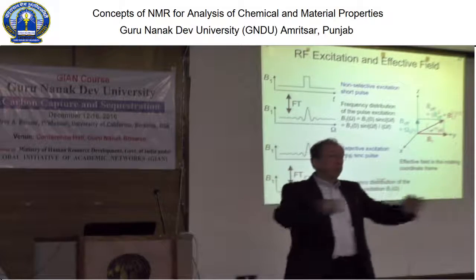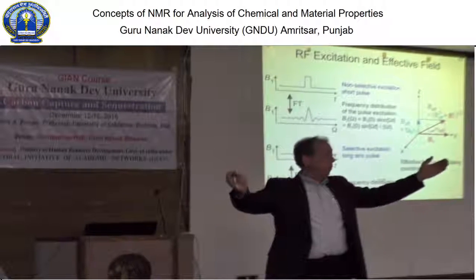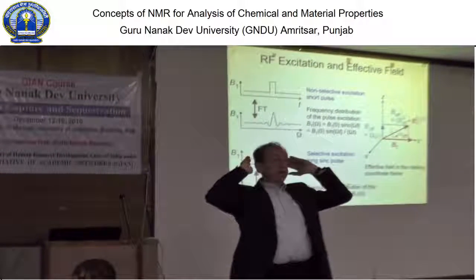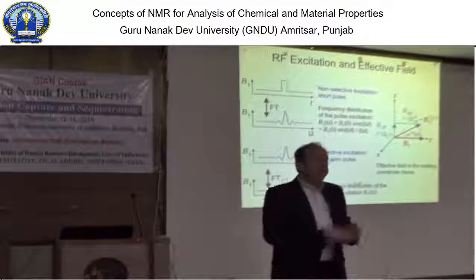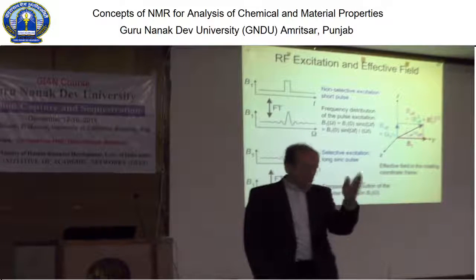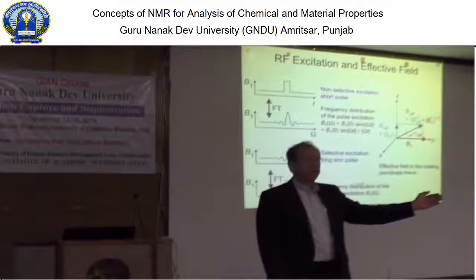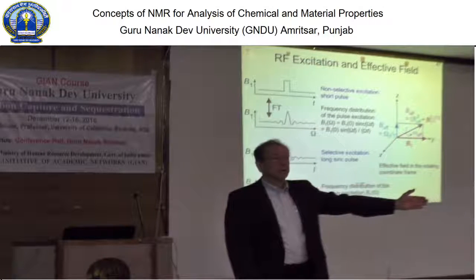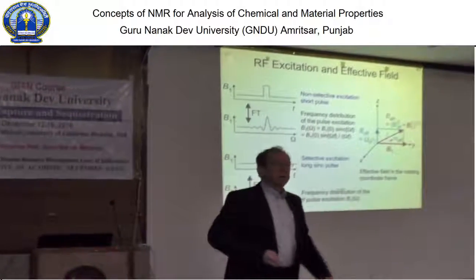Now, in practical terms, that means you want to excite the whole spectrum and get the magnetization from all components, the phenyl, the aromatic components and the aliphatic components, and rotate those that have different frequencies all into the transverse plane to measure them. You need a bandwidth of your excitation. If it's just on one particular frequency, you do, let's say, only the methyl groups, but not the methylenes and the aromatics. So only the red bicycle rider, but not the yellow one.